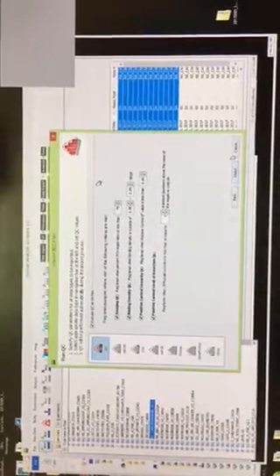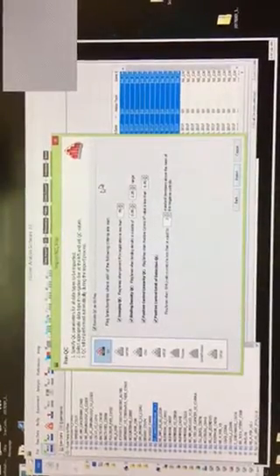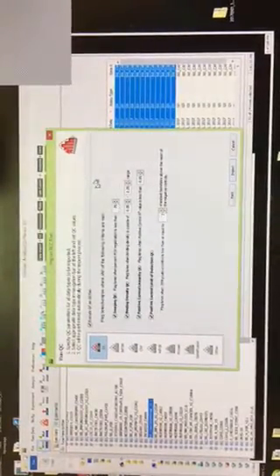And this is kind of an important window. You don't have to actually do anything here, but it's important to understand what's going on. There are two points in NSolver basic analysis where some QC metrics are applied. The first one is when you import the files. It's looking for any systemic problems, independent of sample quality. It's looking at the imaging quality, and how many fields of view are registered.